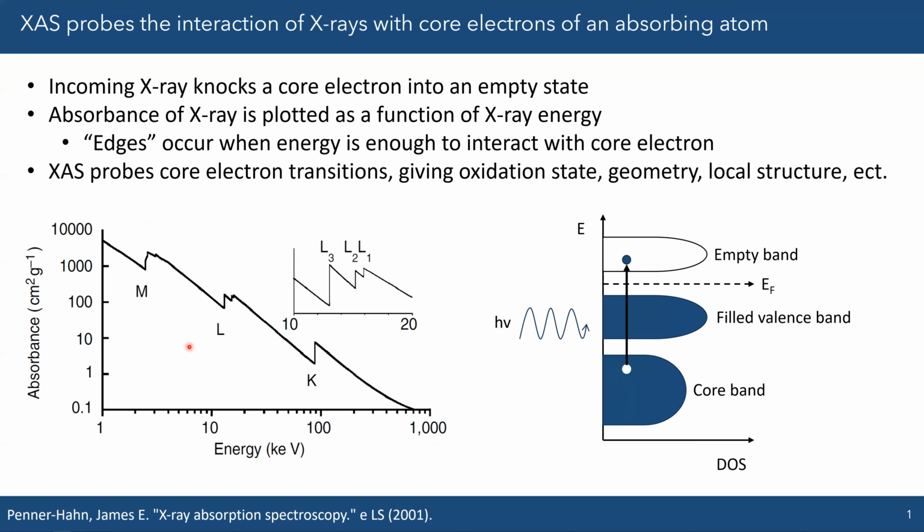The splitting, the tiny little splittings like L1, L2, L3, is just like 2s, 2p? Yes. L1 is 2s, and L2 and L3 are both 2p orbitals that have been split. They both refer to 2p, but different 2p orbitals.